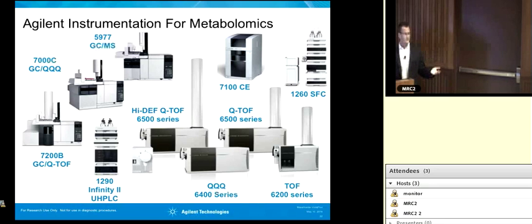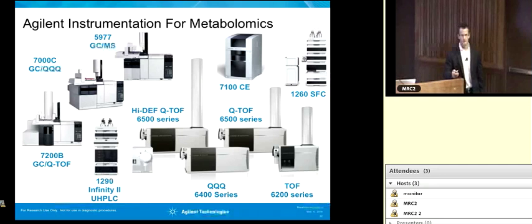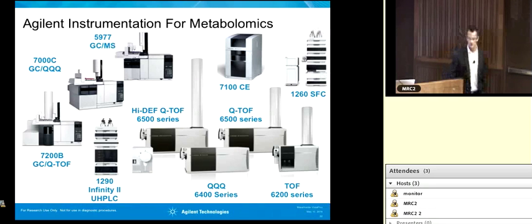So now that we've done all this data extraction, and it took roughly about 90 seconds, even on my humble PC, I've processed about 15 data files with 17 targets. So this part is very fast. We can visualize the results in our software that's called Omics Premium. We're going to go into some details here, but I'm going to save most of them for when we actually look at some real data.